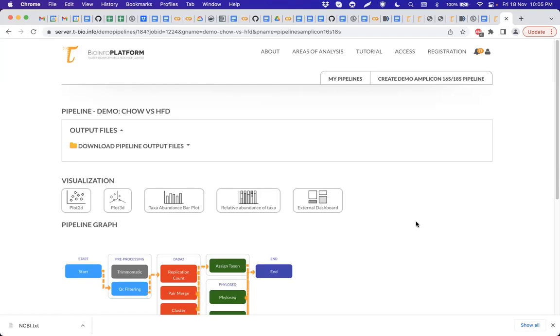We take the reads, define the ASVs, and then run DADA2 inside QIIME. QIIME uses DADA2's algorithm, but before submitting the data to DADA2, it generates these ASVs by a probability-based method.